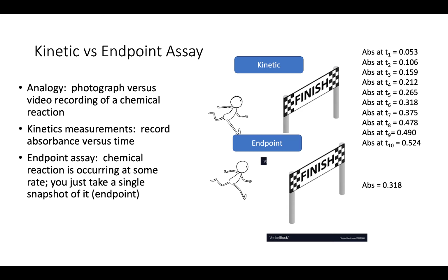So kinetic, you will be measuring absorbance versus time as the measurement. In the BCA assay, you'll be taking a single time point and measuring that. That time point with perspective of your other samples is again critical. So you want to make sure that you're set up to run these all at once in a single setting over a small period of time.